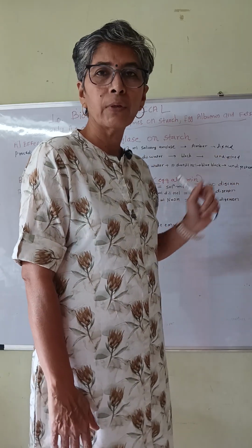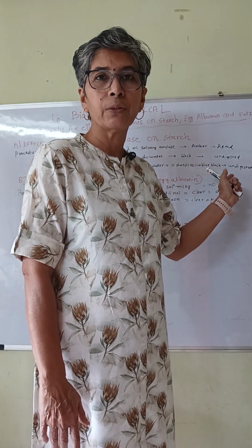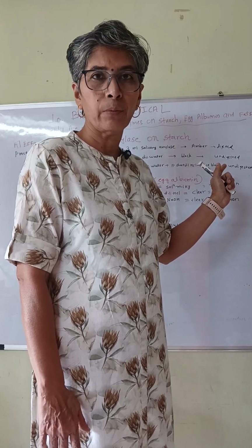These are 3 different results. So write these observations in your practical separately as conclusion and also in the observation table.